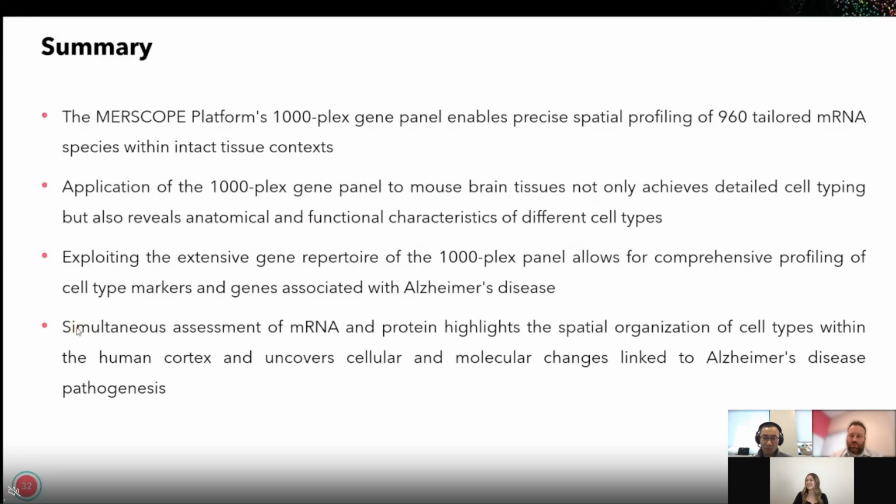Great, thank you. All right, next question here. Could you please repeat how you stain for amyloid plaques in mouse and human brains?